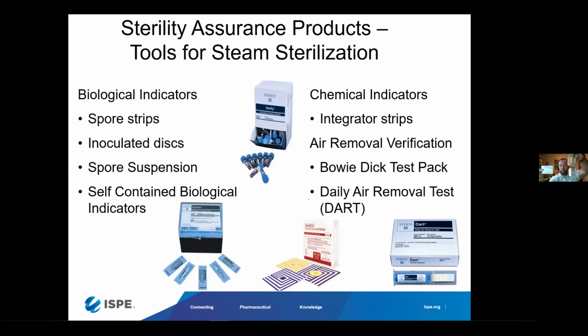So this strip is placed in equipment through the sterilization cycle. Here I have just an example of a stainless steel fitting. I'm not sure if you can see inside, but there is in fact a biological indicator, and the wire here is a thermocouple that's placed adjacent to the biological indicator in the stainless steel fitting. Now that's how you would prepare this part for sterilization.